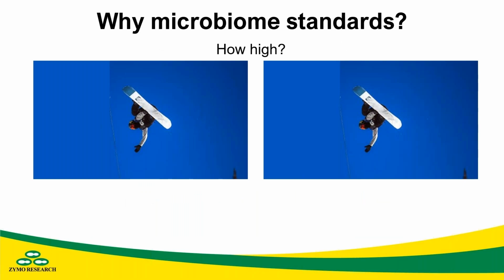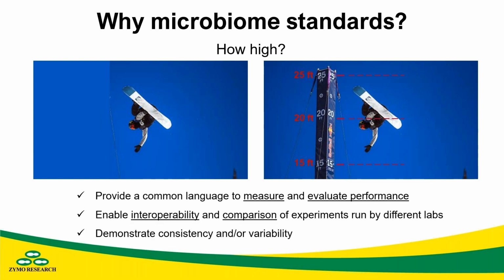Take this snowboarder. Without any point of reference, it's really impossible to determine the height of their jump. But using standards and controls, we can not only evaluate the performance of our protocols, but we can also ensure consistency between different experiments in our own lab and even compare experiments run by different labs, facilitating multi-lab collaboration.